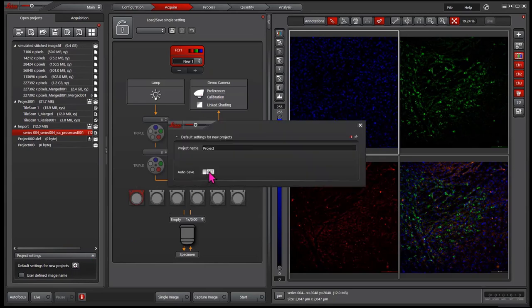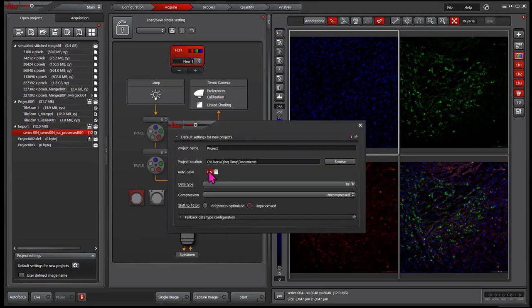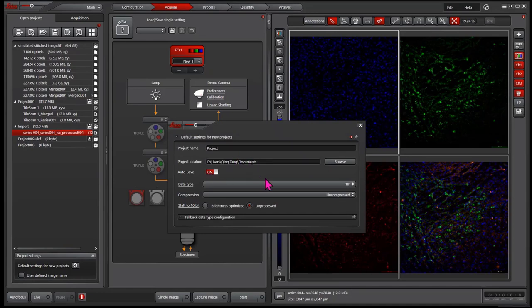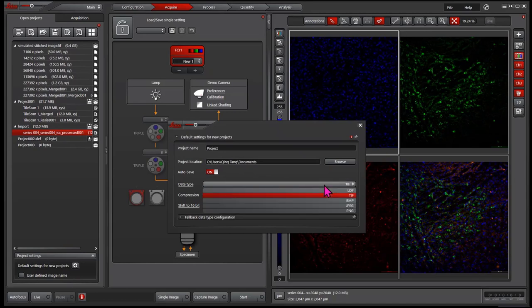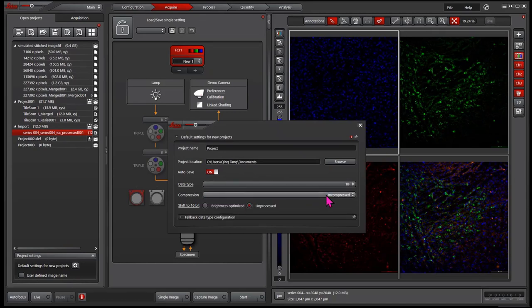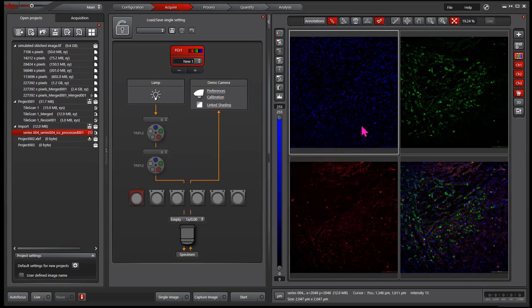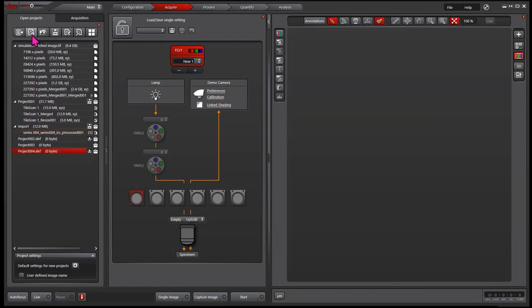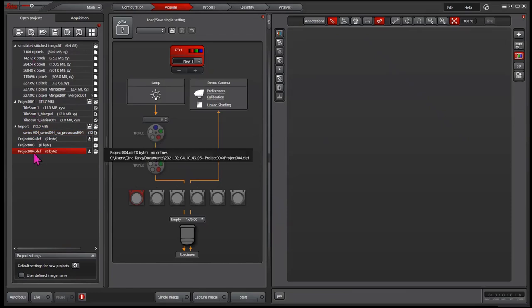There you can click the autosave button, define the folder where you want to save the picture, and then the format you want to save the image data. Usually people choose TIFF. We then close this dialog, add a new project. The new one will be called XLEF format.